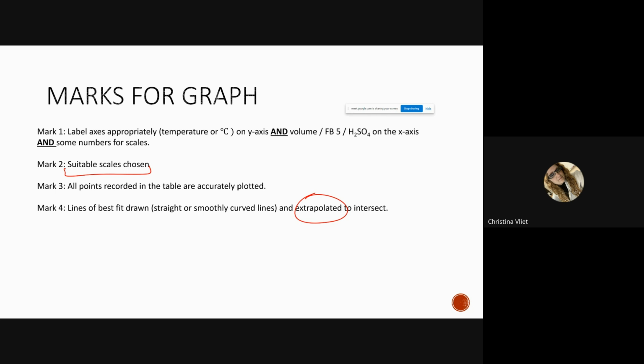Did you read it? Are you serious? I mean, that'd be read from here, right? Right, but my maximum temperature. For the volume, it's gonna be somewhere between 15 and 20. How am I supposed to do the math? You didn't label your axis. Temperature, degrees Celsius. You should probably be doing that.